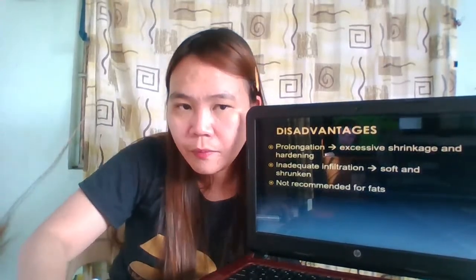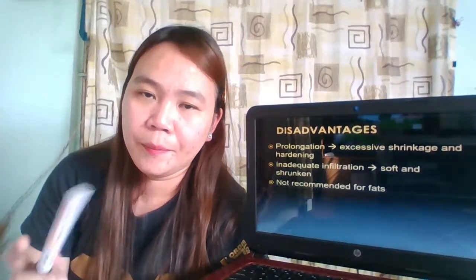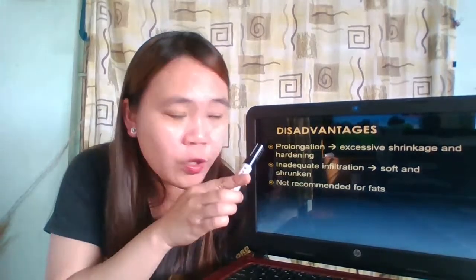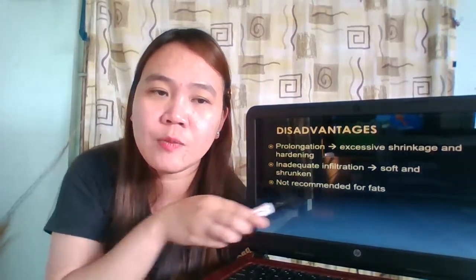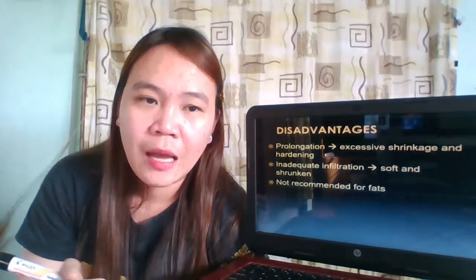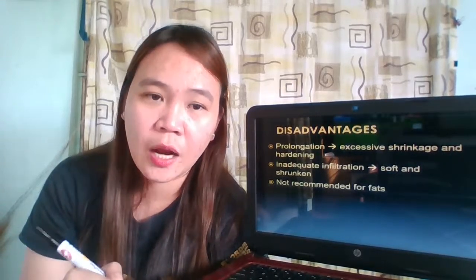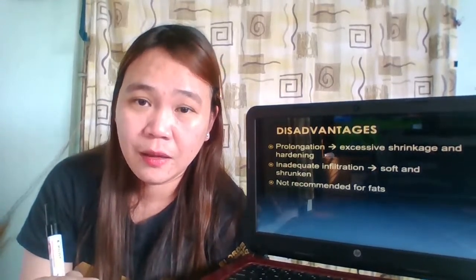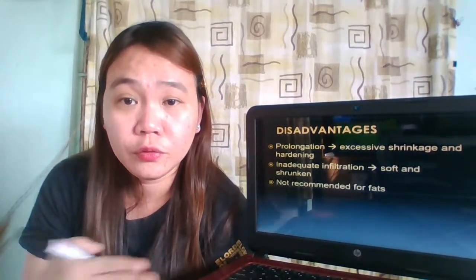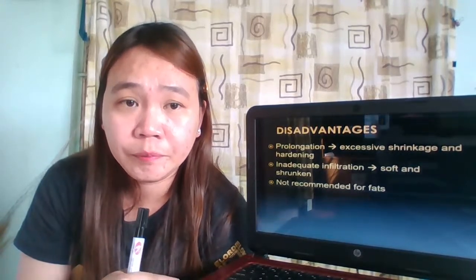The problem with paraffin impregnation, especially if we consider prolongation: for tissues which are difficult to infiltrate, we really need to perform prolonged infiltration.